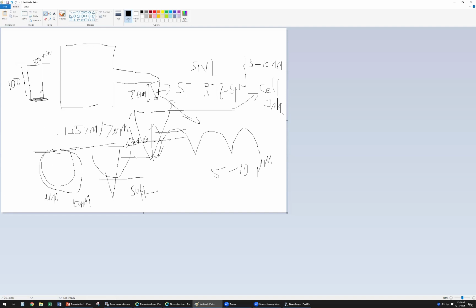For this kind of material, it's very difficult to get the modulus. You can get the depth, but you cannot get the depth and the width. If you go to PeakForce QNM, this is quite difficult because of the probe. Another problem is, say after this there is another trench, so it is kind of suspended here. Is it possible to measure?